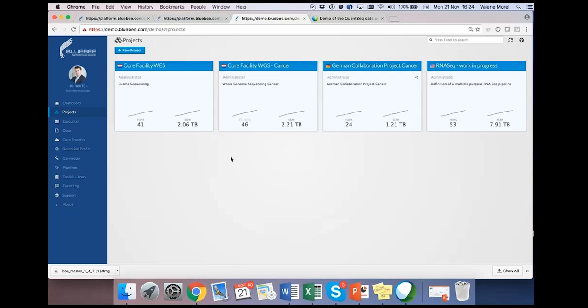Thank you, Michael. And the second question is, how long does the analysis take? Can you please also comment on this? Apparently it depends on the size of your input data, but usually in our test cases we had 10 to 20 minutes per sample, and since it's running in parallel, I would guess within 45 minutes the whole lane is analyzed.